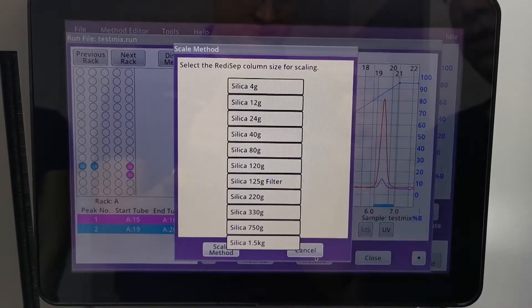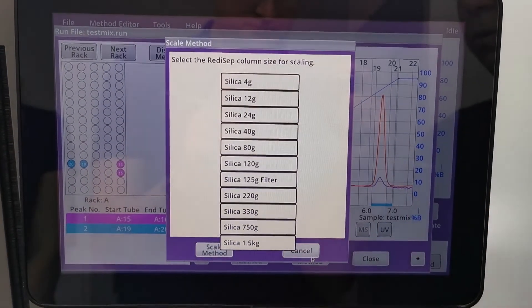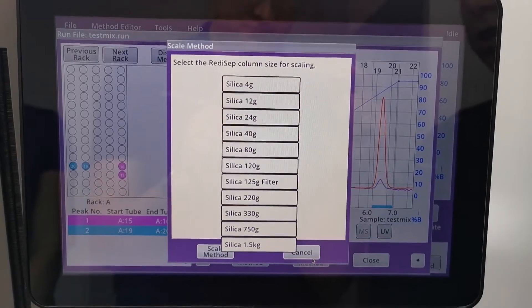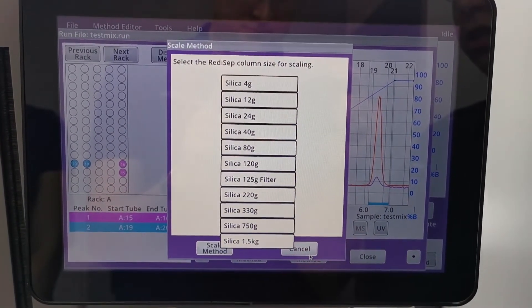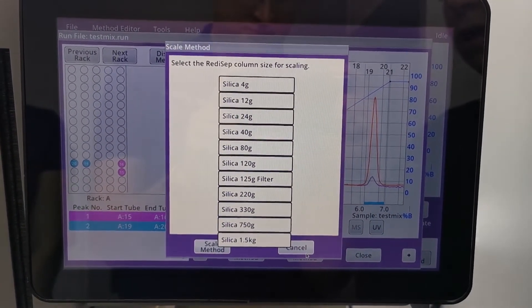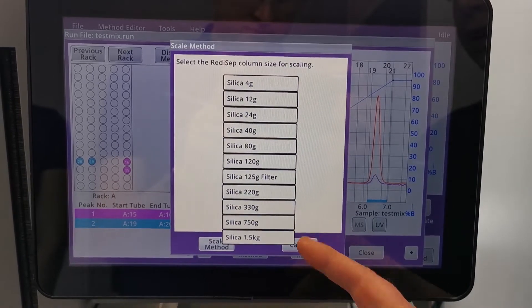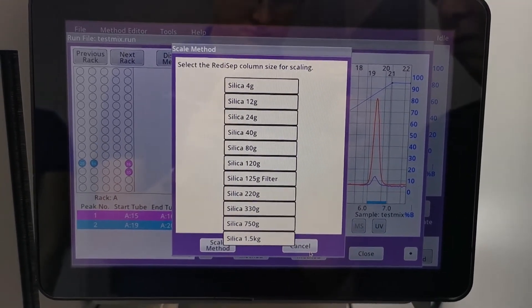We hit the scale up method, we choose one of the larger columns. We can use up to a 330 gram on this system and with an adapter we can actually go up to a 1.5 kilogram.